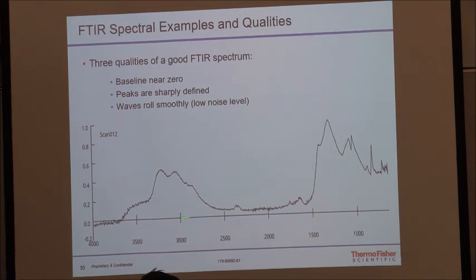is this relatively flat or smooth? I see some of this, so there's some noise, there's some interference. Maybe that's precluding the device from giving me a hit. But I do have data. So hopefully if I run that again, I'll be able to get a good hit. Okay? So that's really from a spectral thing. I don't expect you to go back and say, hey, at 1,400 wavelength, I have this specific type of chemical bond movement.